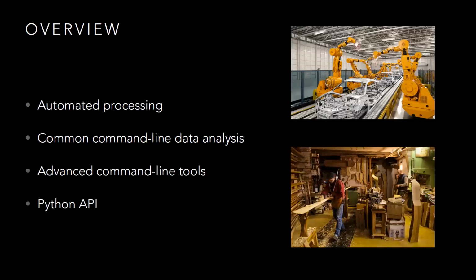So, as an overview, I was going to start off talking about the automated data processing that is maybe useful if you want to put tools in place, automated processing for your users. There are some command line scripts that you can use to make your own automated tools if you feel so inclined. There's a few very useful, more advanced tools, and ultimately there is a Python API. There's also C++ in there as well if you feel really keen, but at that point you'd be asking us, not me.